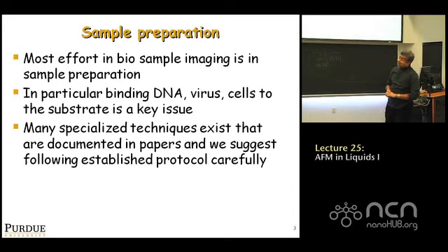And this is a very tricky issue, and depending on what you want to immobilize, whether it's DNA or protein or bacteria or living cells, there's a whole lot of surface biochemistry that you need to understand. And the physical principles behind what you choose to stick things on a surface is a pretty complicated thing, all right? I will point out that there are many specialized techniques.